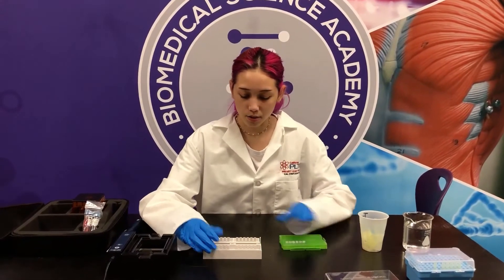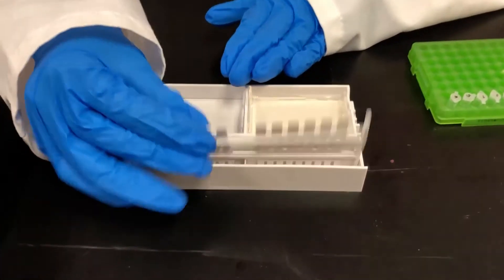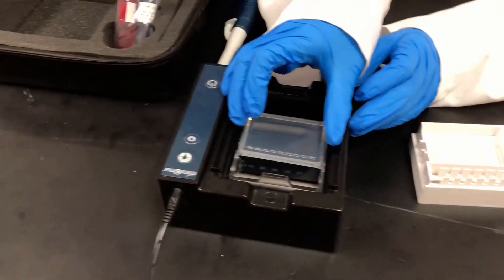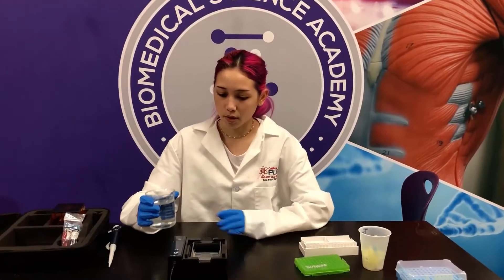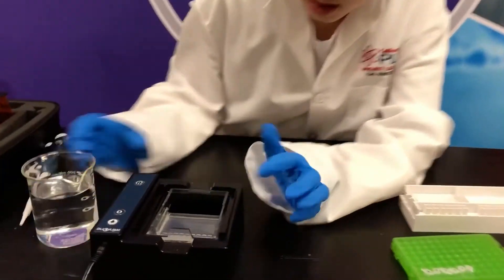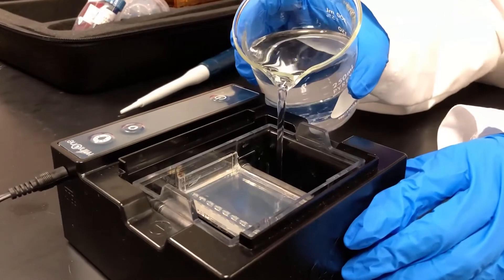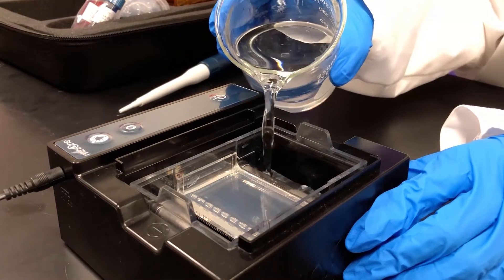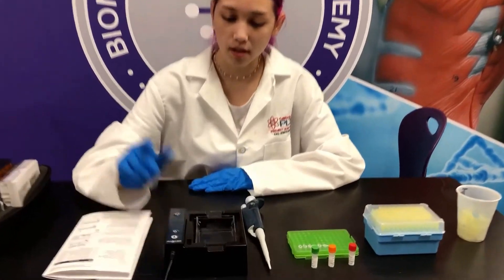Now I'm going to take out this comb, then pull out the gel tray — it'll only go in a certain way, so make sure to put it in the right way. Now I'm going to pour this buffer in. There are two lines inside of the well — that's where I'm going to pour my buffer up to, so I'm going to pour it in on the side. Now I'm going to turn on the low intensity blue light by pressing the light bulb button with the smaller light bulb.